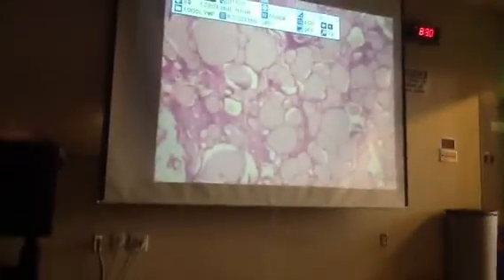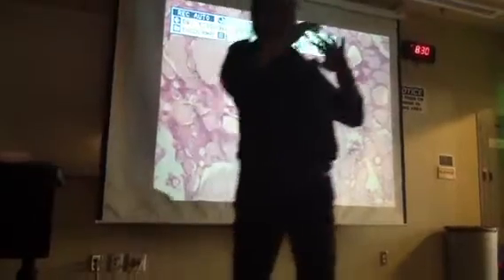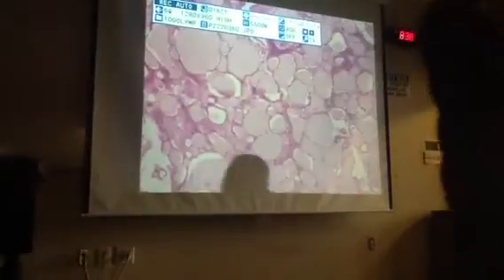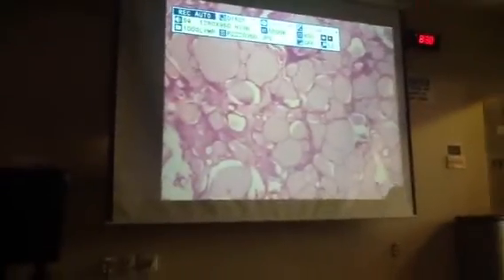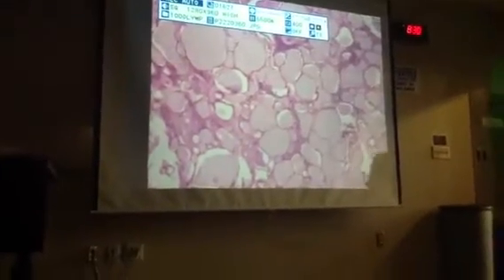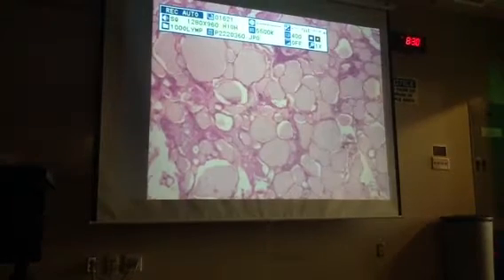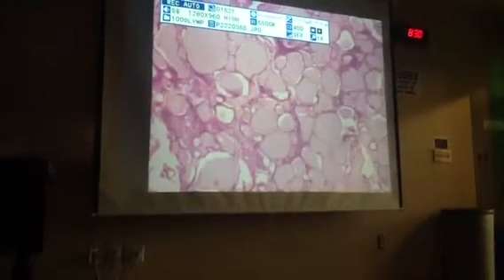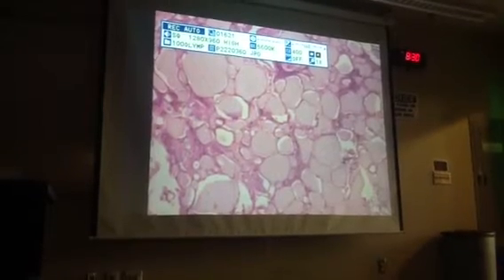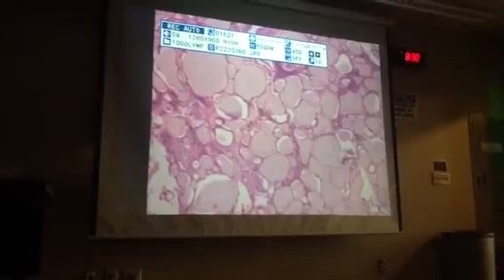You actually have microscopes at your station. The slides will be taped into place, so you definitely don't want to be switching objectives or moving the slide around. They're going to be in a particular area on a particular objective, and which objective I use will depend on the slide and what I'm trying to get you guys to identify.